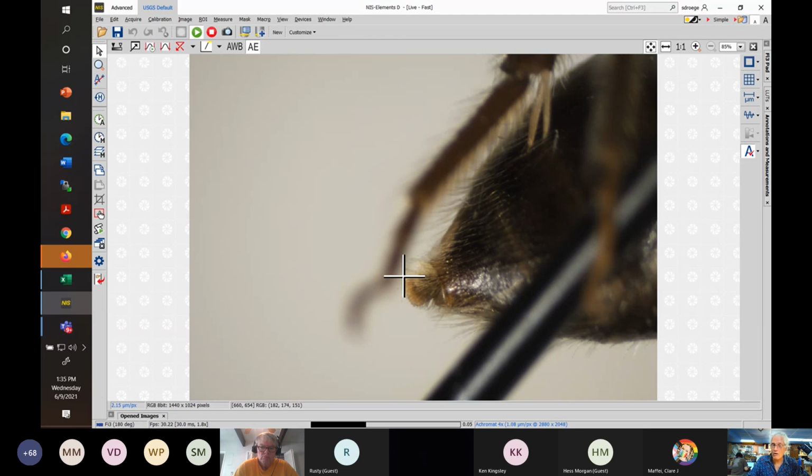Andrena is actually, even though they're all little black bees to some extent, full of good characters, but a lot of them you need to learn what to look for in these shape kinds of things. So for right now, that's S8, and you see no genitalia visible here because the genitalia, which are quite large, are retracted inside the abdomen. And that's the normal state. But it's quite regular to see, for whatever reason, the genitalia exposed, but normally they're pulled in and not therefore useful. But almost always you can find S8 somewhere.